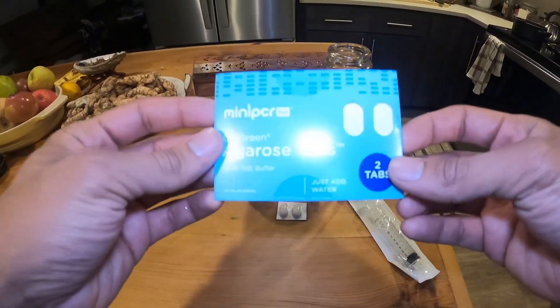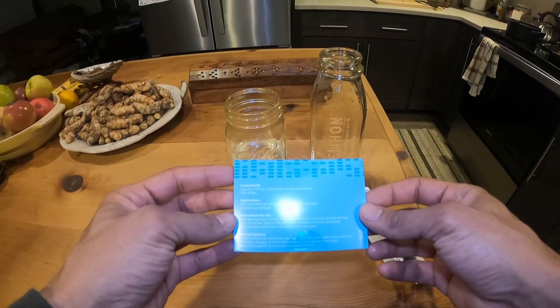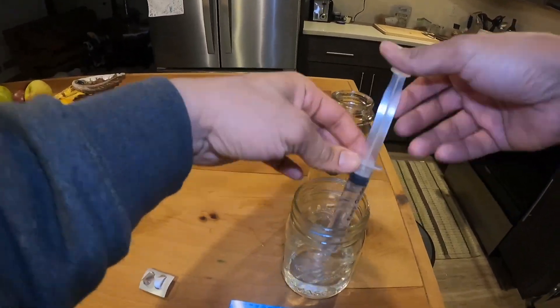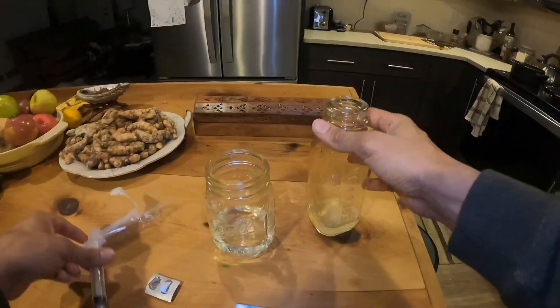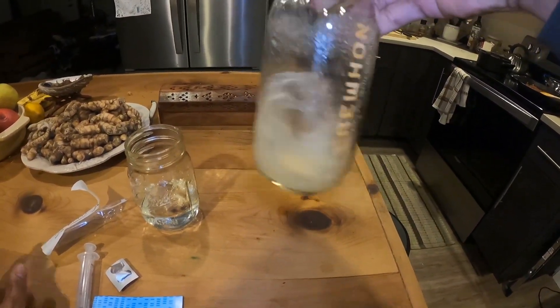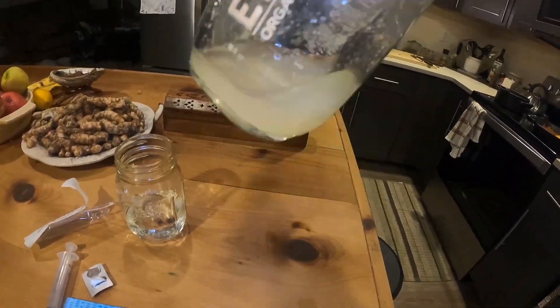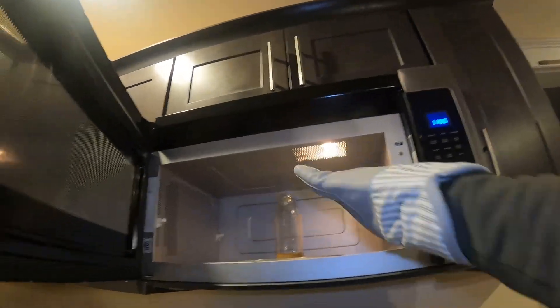Now I got to testing out these gel green agarose tabs, and I have to say I was super thrilled with these — I didn't even know they were coming in the kit. Per tab it's 20 ml of distilled water for a 2% agarose mix. I just mixed it up in a little glass vessel and threw it in the microwave. Honestly that was it. I didn't have to weigh any agarose, mix up any TBE, or drop any gel stain in. It has the gel stain in it, it has the TBE in it — all I did was mix up the water and throw it in the microwave.